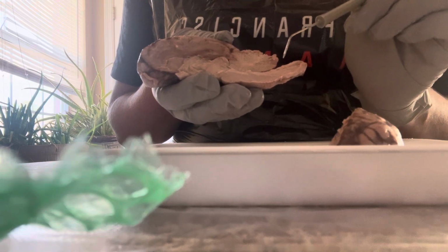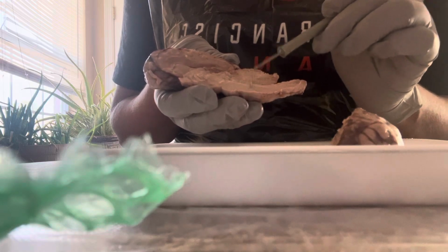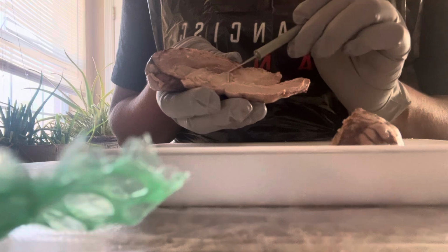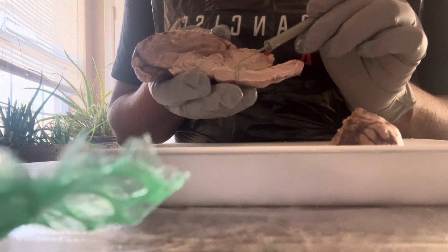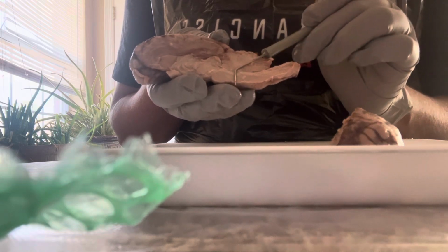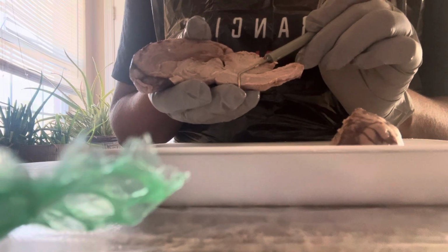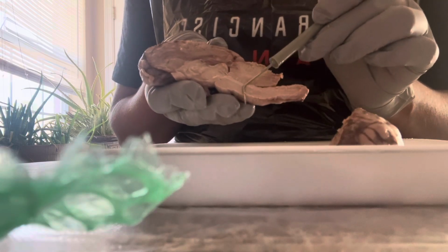From there, of course, we go over to the medulla, and that's going to be more towards the bottom here. So we have the other one up here. We have the pons around this area, and then the medulla comes down this way. And the medulla contains centers for heart rate, blood pressure, and respiration. It also contains reflex centers controlling coughing, sneezing, and hiccups. And that's going to be more towards the bottom here on this medulla part.